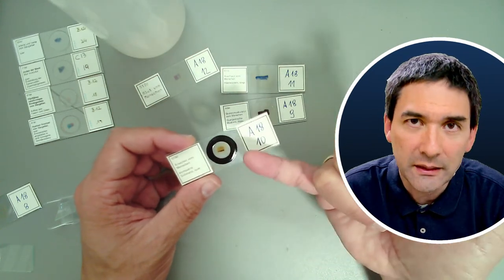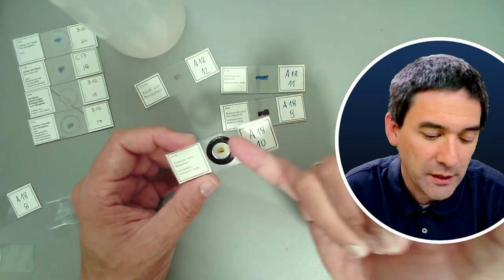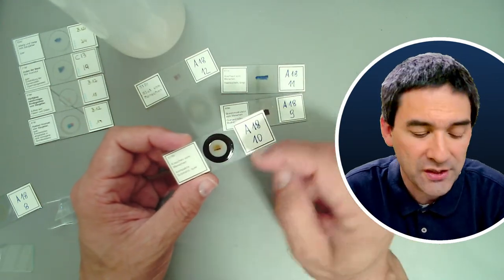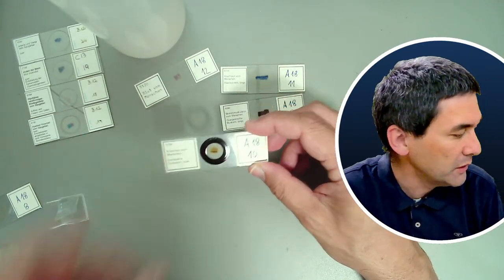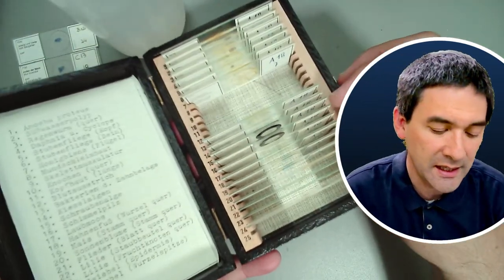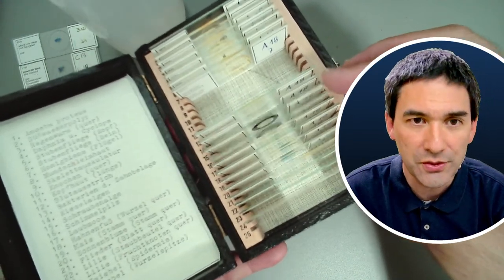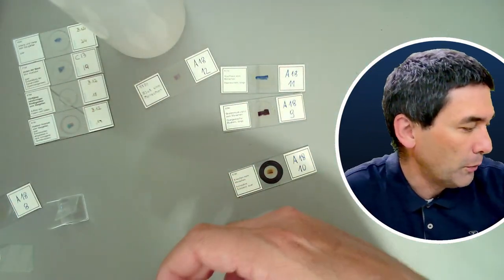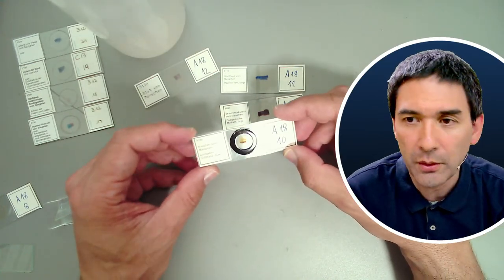Those mounting media, because they are only semi-solid, have to be protected a little bit from complete dehydration and from moisture changes, and therefore they put this ring around it. It also fixes the cover glass to the slide better, so it gives better physical stability. When you look at the slide box, like I have over here, you're going to see that some of the slides indeed have this ring because of the mounting medium that has been used. So the ring actually tells you a little bit about what mounting medium the company or the person has used.